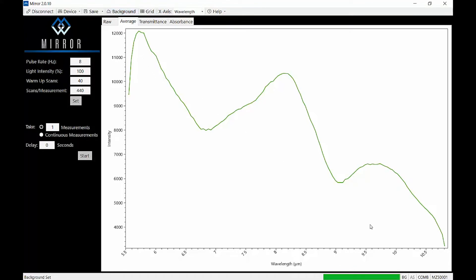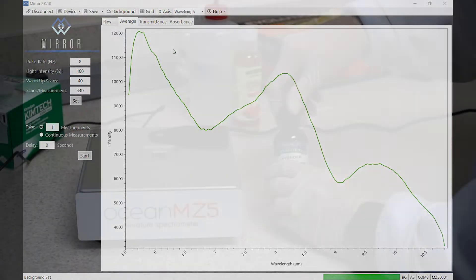When a background spectrum has been saved, the BG on the status bar at the bottom of the software window will change from gray to black, and a message will appear on the left side of the status bar to confirm that your background has been stored. Note that you must set a background spectrum to see the spectral data in absorbance and transmittance mode.